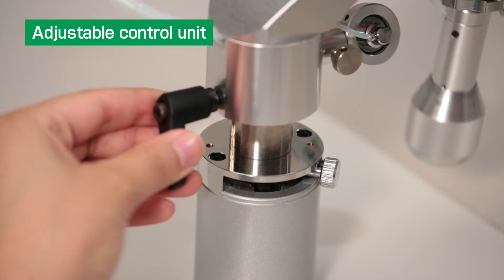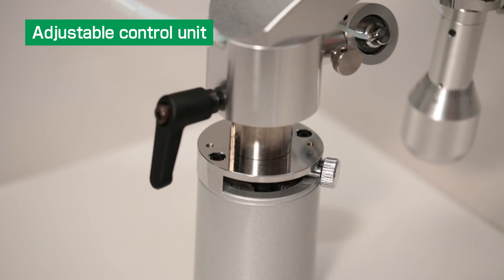The height of the control unit and the length and tension of the joystick can be adjusted.